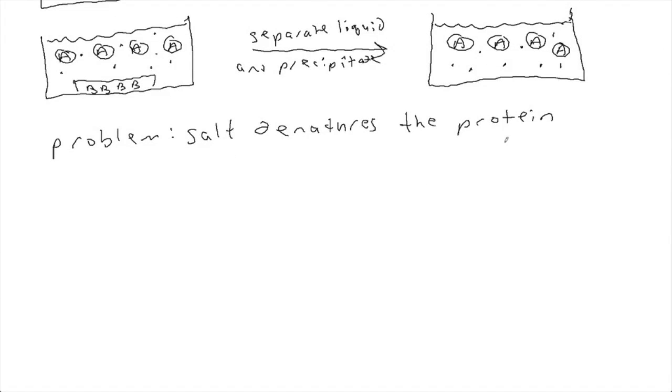No. This is where we use dialysis. This is where the dialysis comes in that you were thinking about. So I think you were a little confused before about the purpose of dialysis. So now we take this and we put it in a dialysis bag.